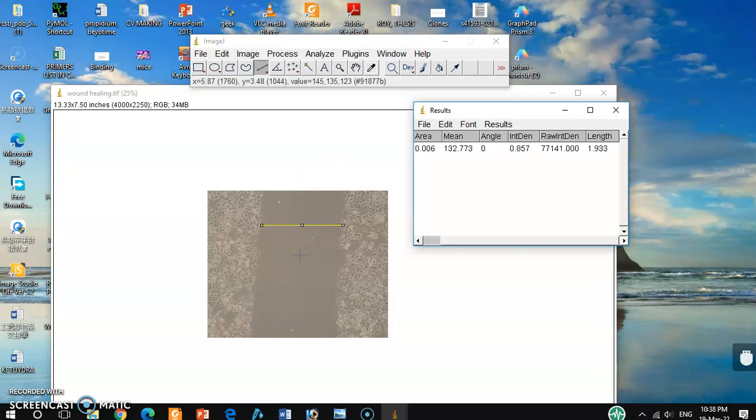For wound healing assay, you have to measure in three different places. After that, you have to average it, or you can also directly use those different values for statistical analysis.